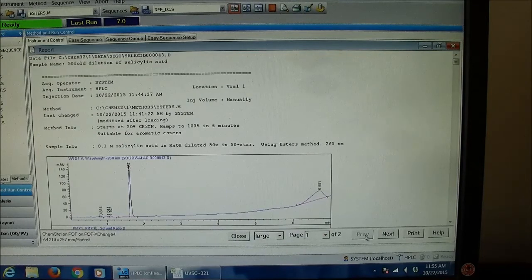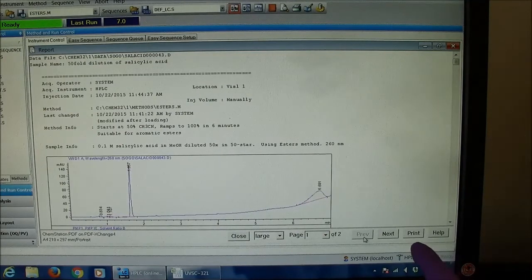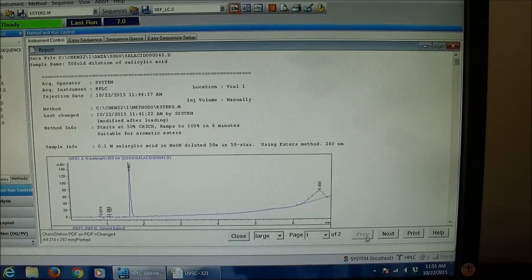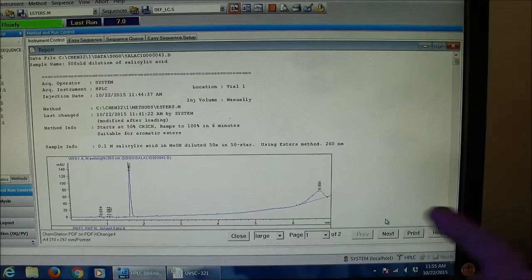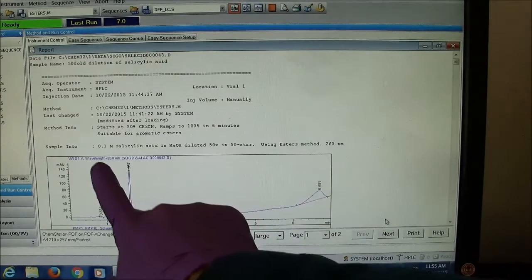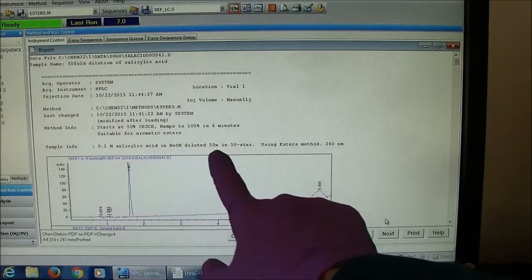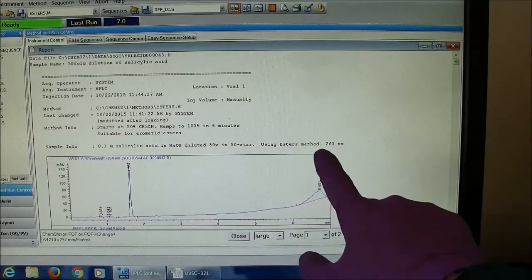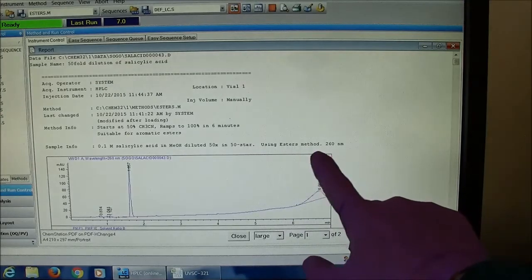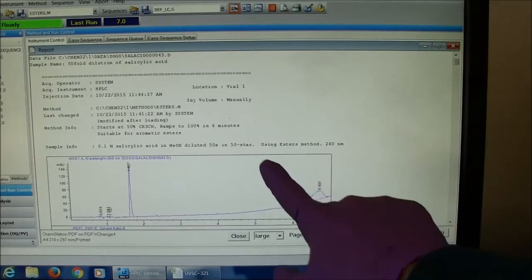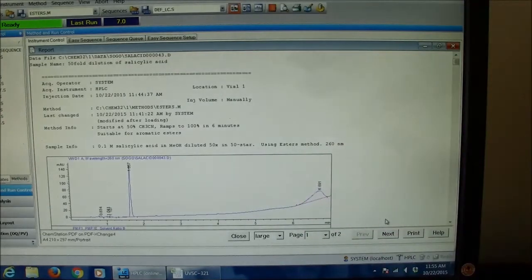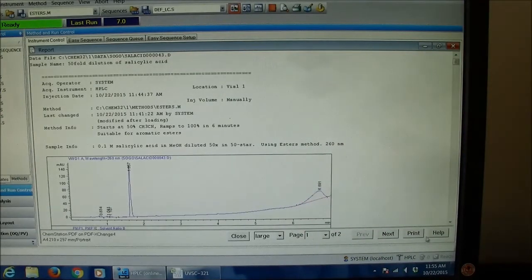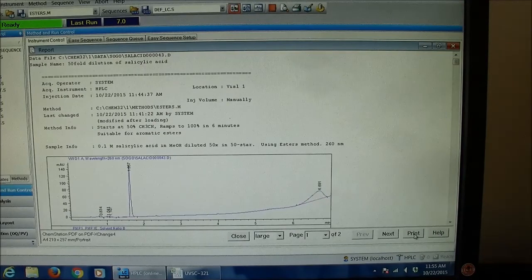I can save this data by printing a PDF. This is highly recommended. The sample info is really important because that's where I typed in what this is. If you don't have that, it's hard to know what you're looking at.